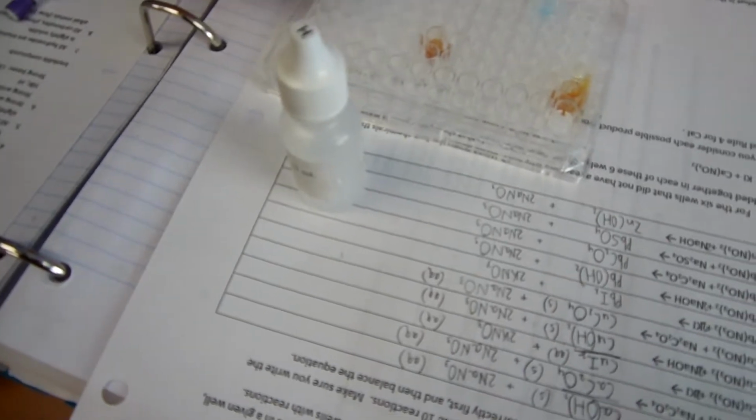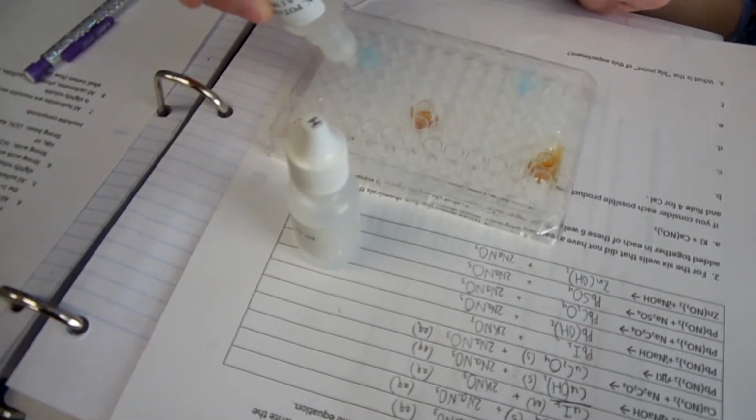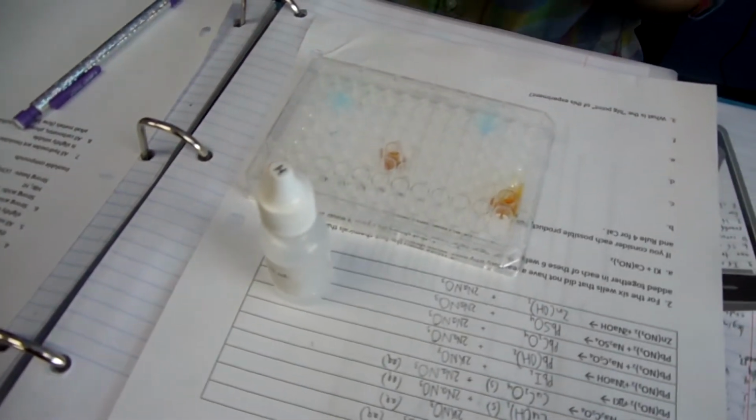So one or two drops of each in the same well. Any well you like. Oh, did I skip you? Yes. Sorry. I'll let you do the next one. You skipped me. I skipped you.